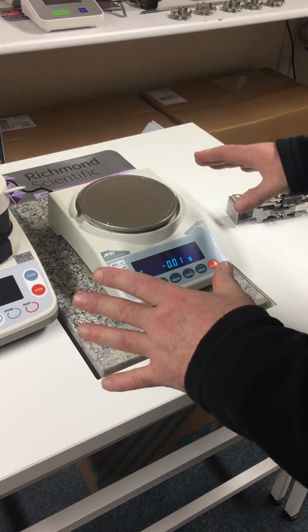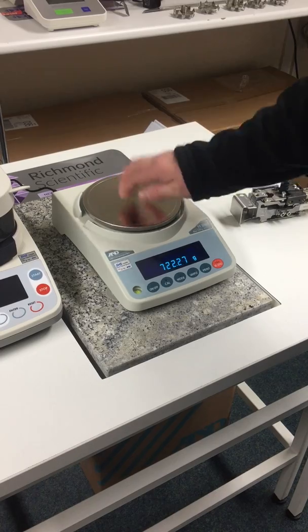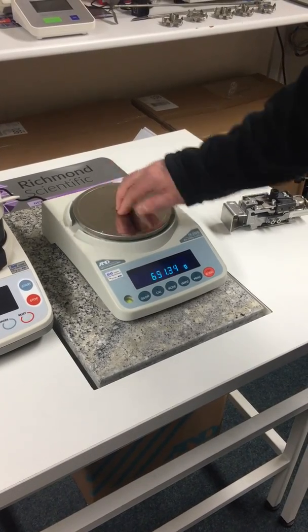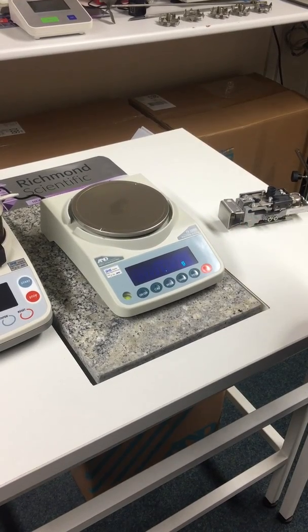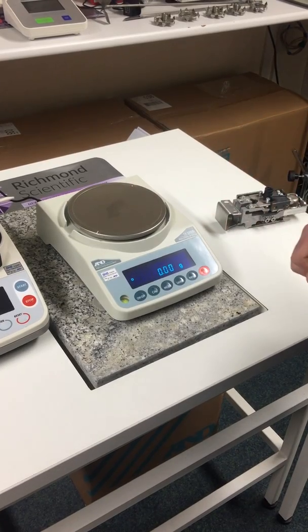What I'm going to do now is demonstrate on this particular device. If you did this with any other type of balance, the likelihood is it would break. I'm giving that quite a lot of force there. We'll now re-zero it and you'll see it comes back straight away.